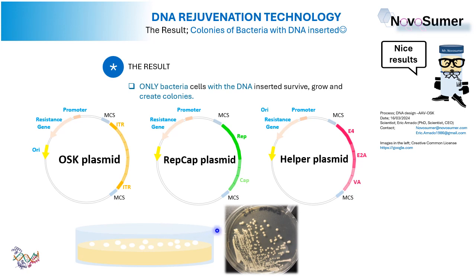So that's all, my friends. These agar plates with the bacteria on the surface can be kept at 4 Celsius degrees in a fridge. So we keep these agar plates with bacteria in fridges at 4 Celsius degrees up to 10 to 14 days. After 10 or 14 days, we will have to discard these plates. Easy? Let's go for the next slide, the summary of what we have just seen in this session.